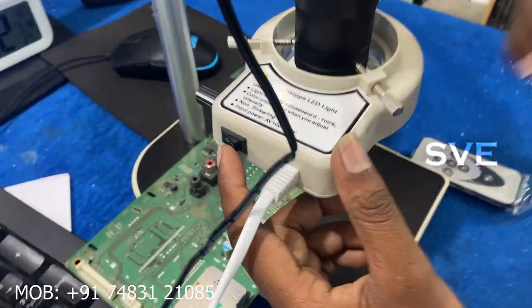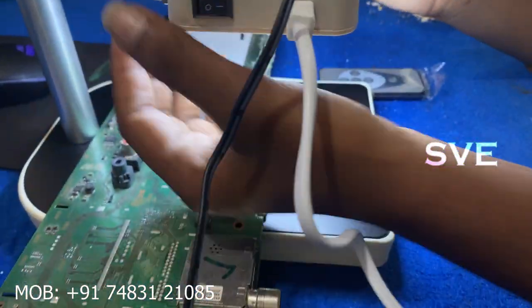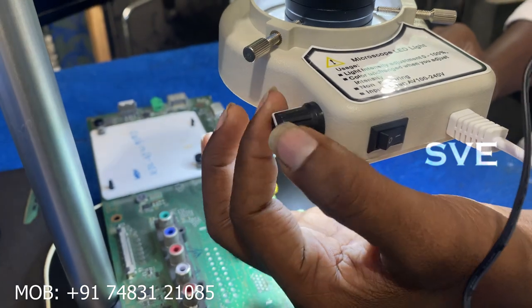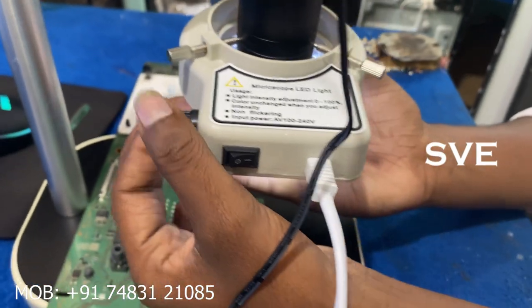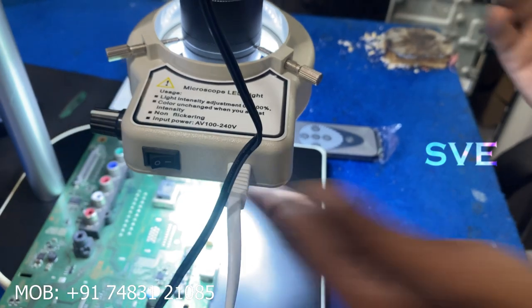Here is the switch for the light. After this light turns on, there is a knob here to adjust the brightness. I will look at my hand — the brightness can be increased and decreased.